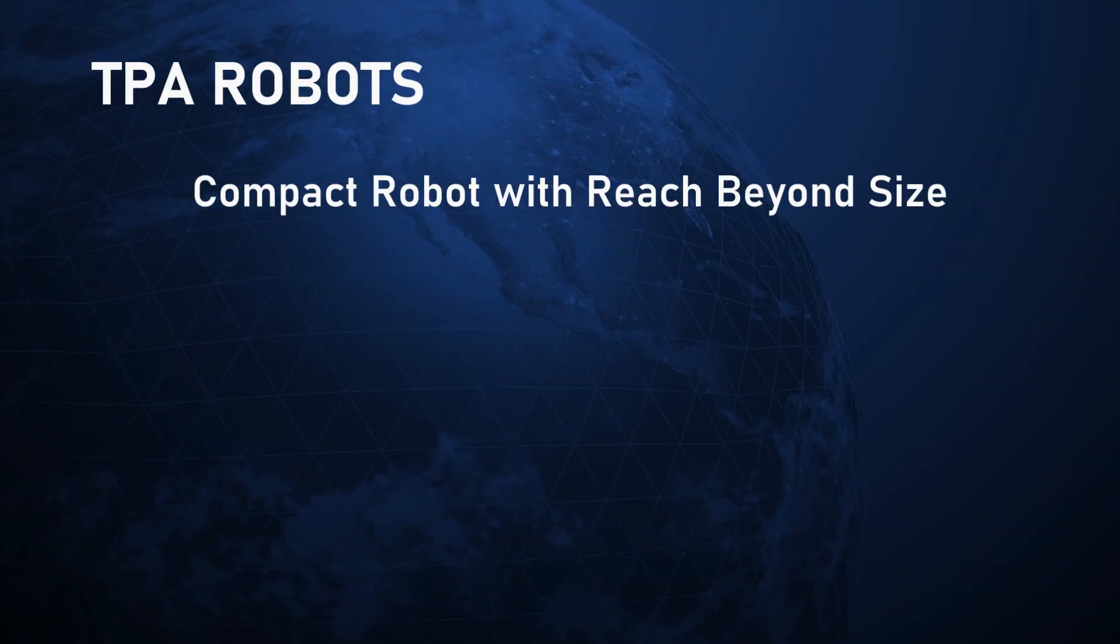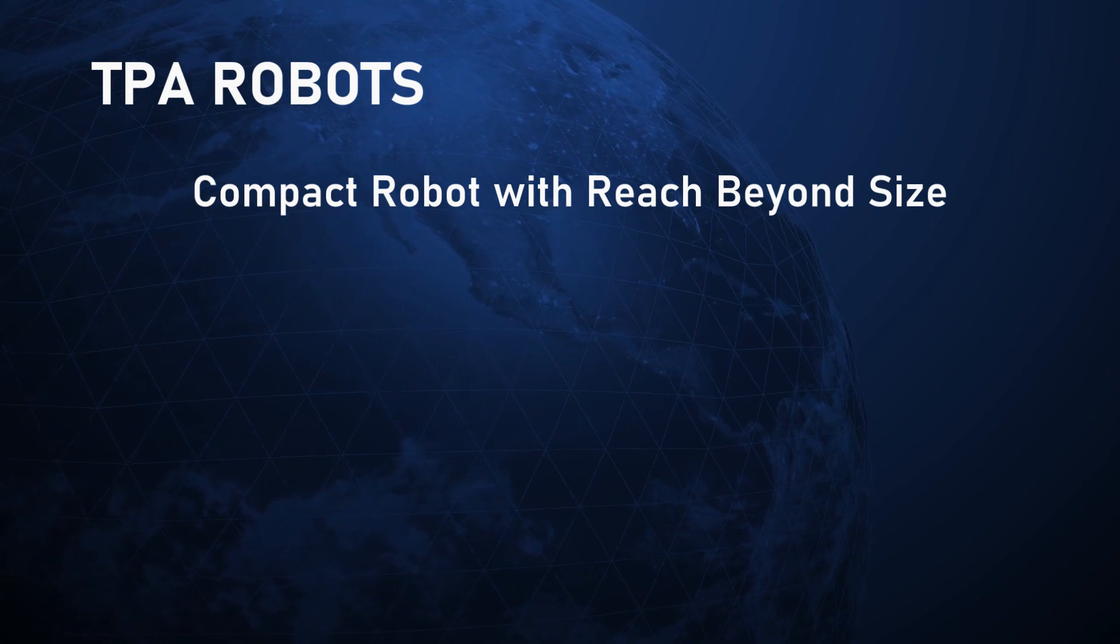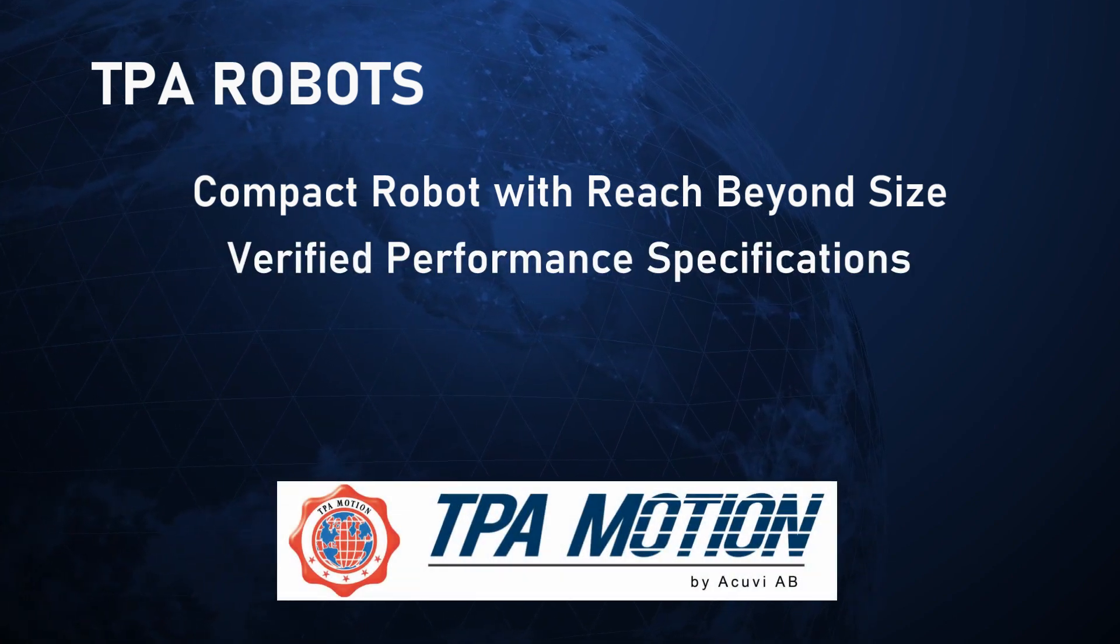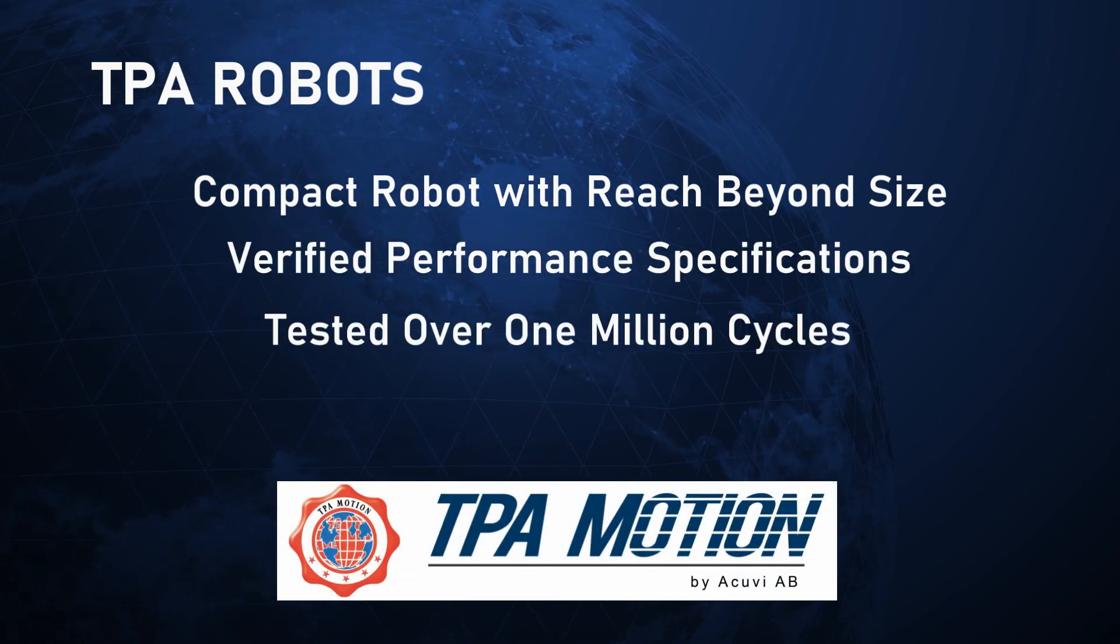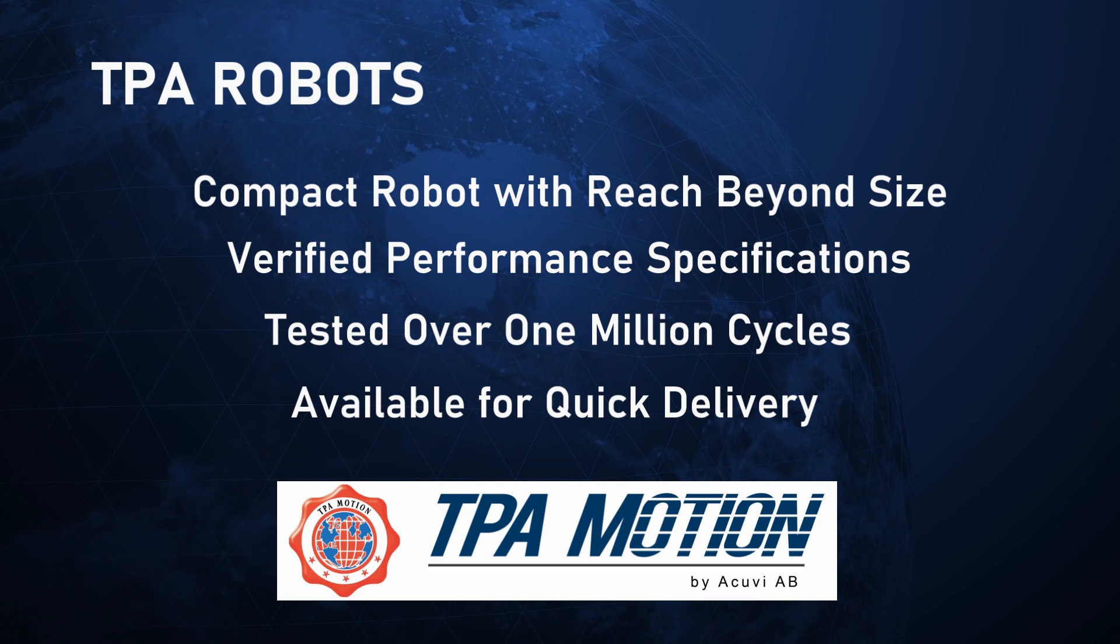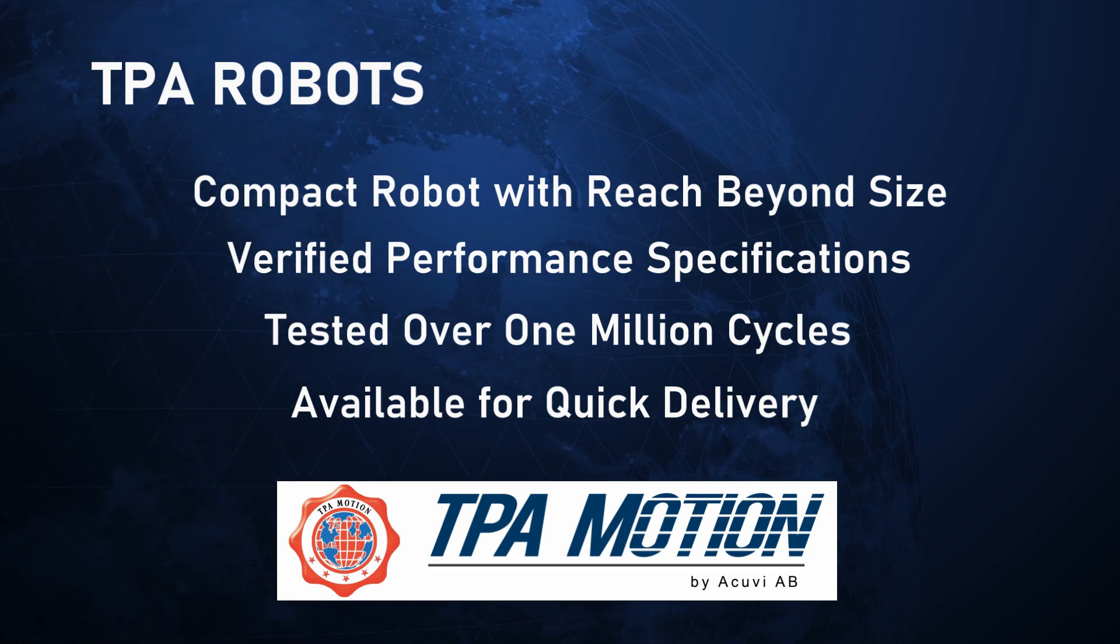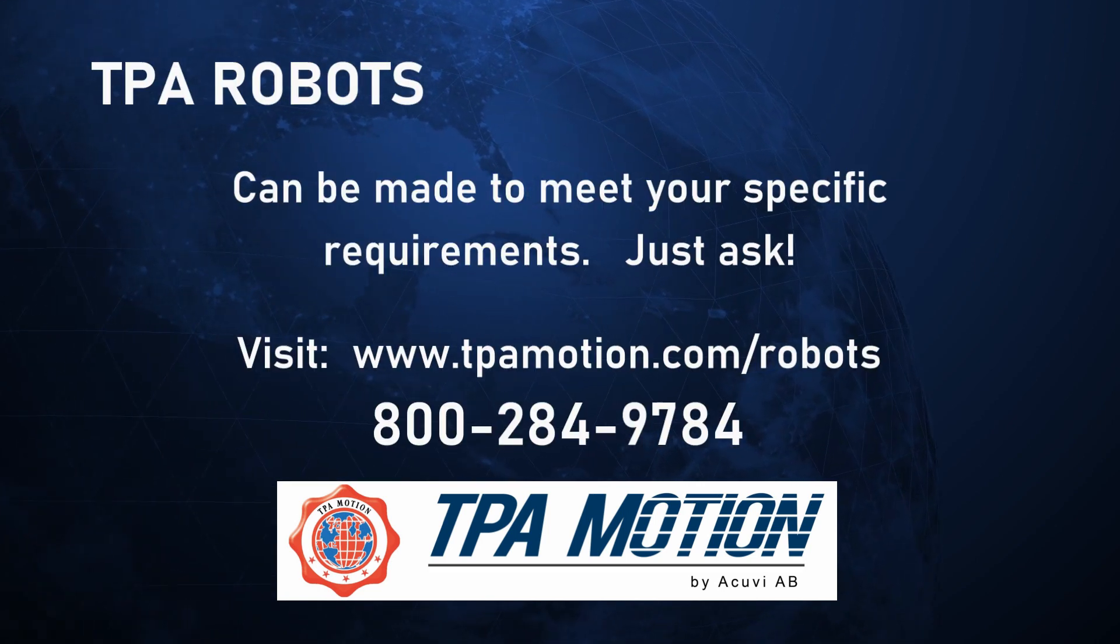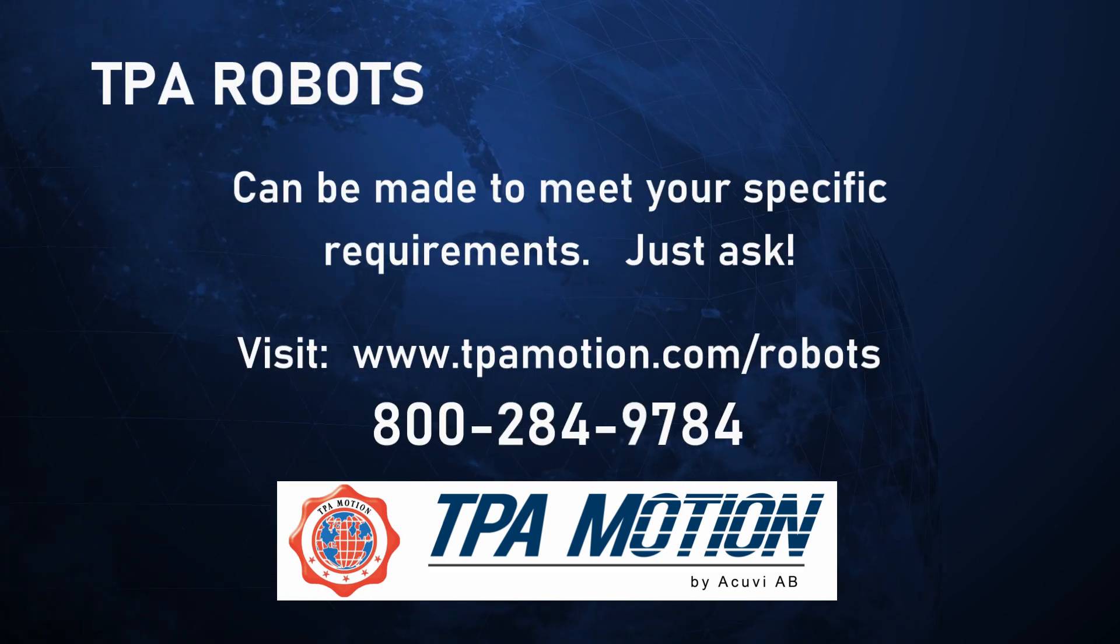TPA's plate robots are available with short deliveries to keep your product development moving forward. Finally, if this robot looks interesting to you but you have special requirements, just ask. Many aspects of this robot can be customized to meet your unique requirements.